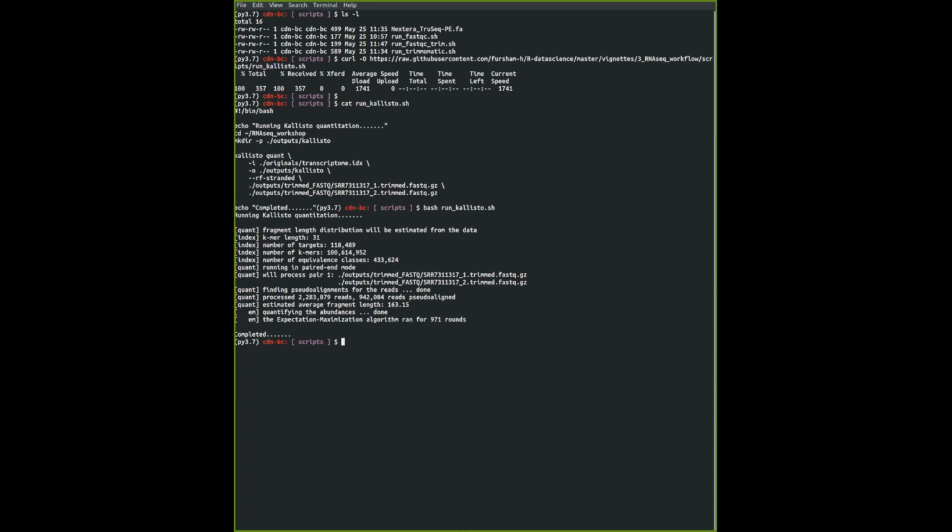The only thing is that Kallisto separates out the count matrix for each of the cells. So if you have 100 cells, it will store this count data in 100 different folders. So you might need to find a way to, there is a simple shell script that you can write. Basically, you have to copy all these files in each of these folders into somewhere, or into the parent directory, so that everything gets consolidated together, and then you can import this into R, or combine them to look at the whole thing together. All right.